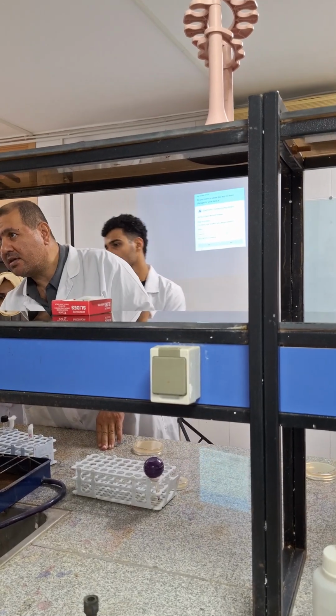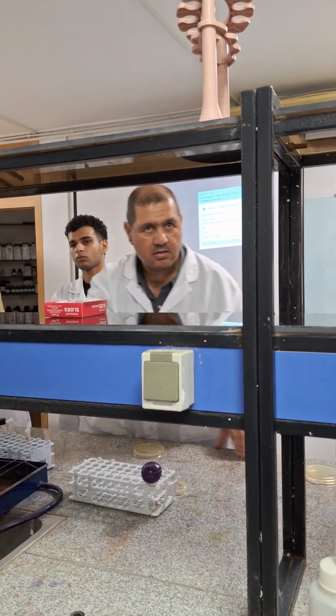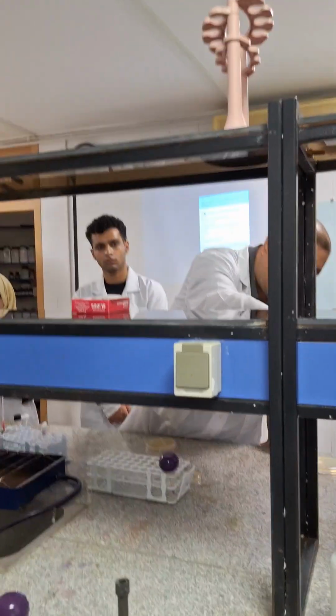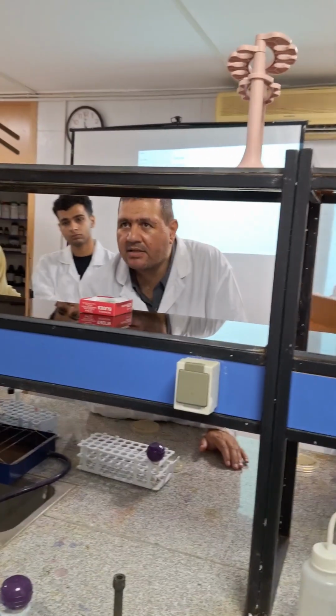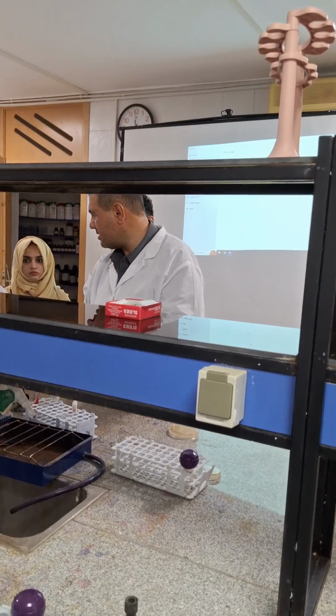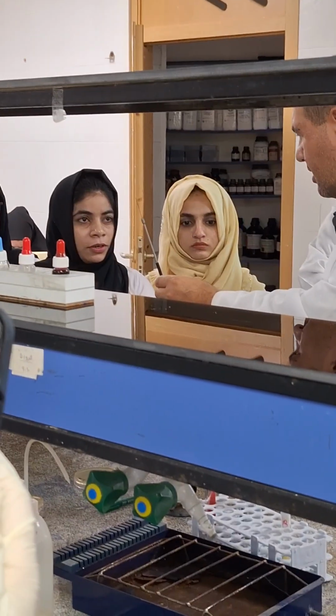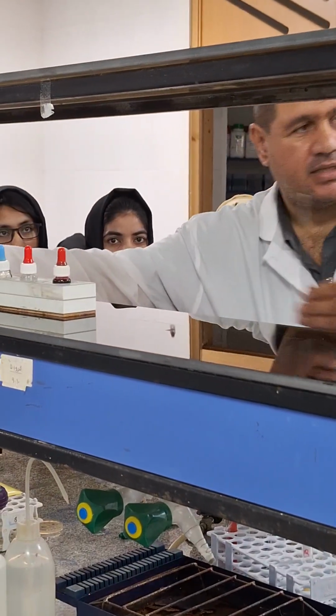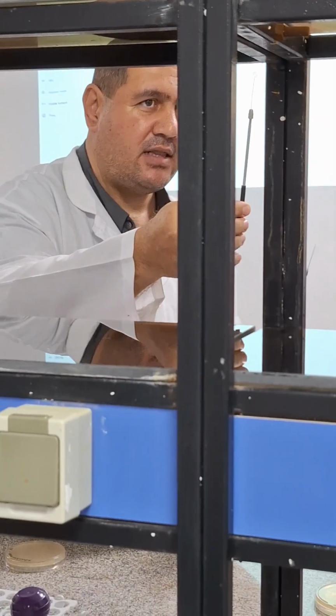Finish your labeling. You write on your plate. Inoculating tools: loop and needle. Very good. Loop and needle.